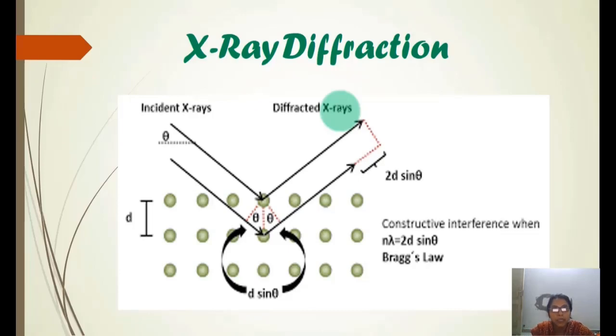Usually we use a monochromatic source, and most of the light is red in color. So you will observe red light, and then a dark region, red light, and then a dark region. So light diffraction consists of bright and dark fringes. But in the electromagnetic spectrum that we have, only the visible rays have visibility to the human eye.